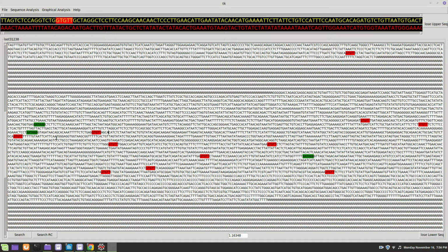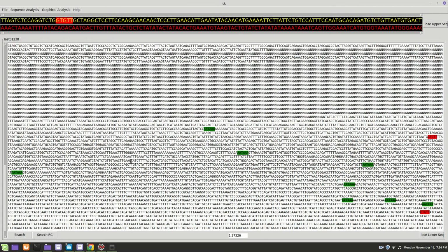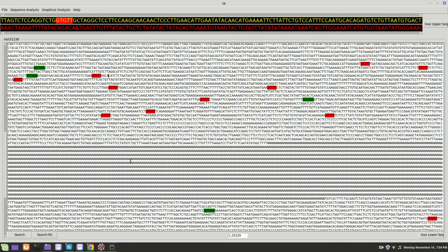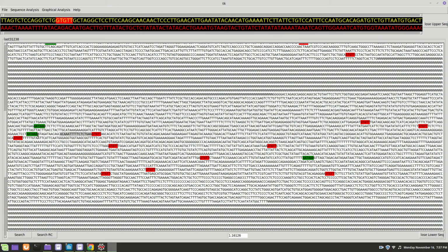But that's not a strong requirement. The fact that this is 30 apart and this meets it and this meets it, those are strong requirements. So this is good. So there is no other option. There are none of them that are even close to this. If you scroll through here, none come anywhere close to it. So you would say that this is your best bet for a polyadenylation signal.